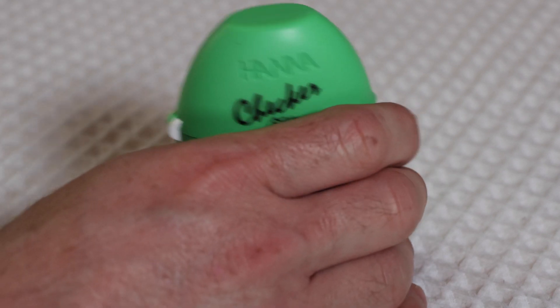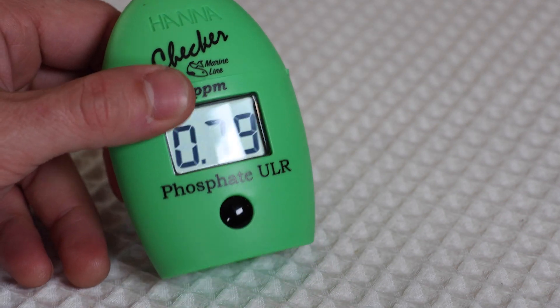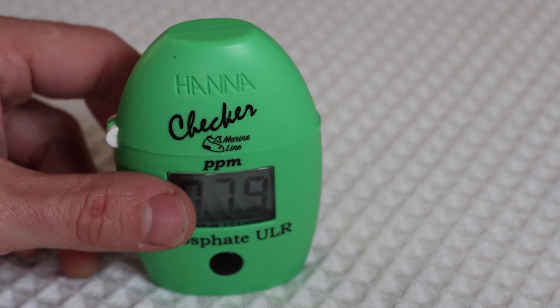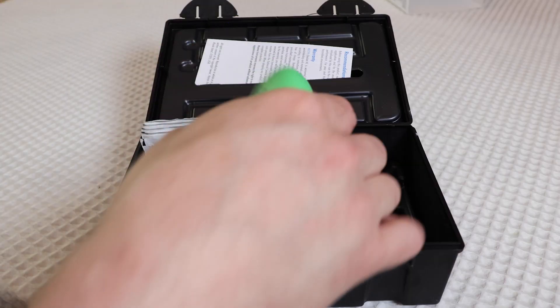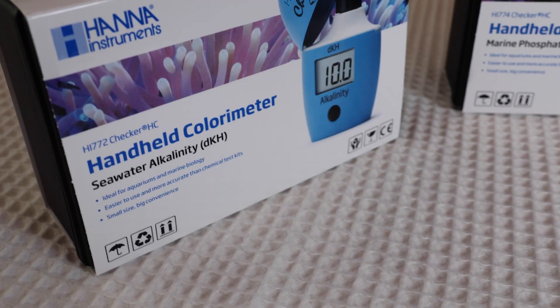Did you believe that? Look at that — close! That's not too bad. I'm ready for a water change for sure, but it's not like everything is going to start dying. So there you have it.